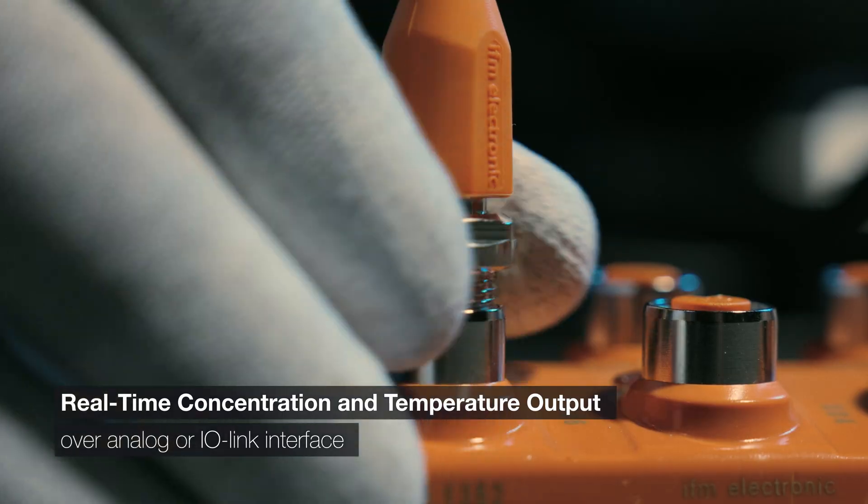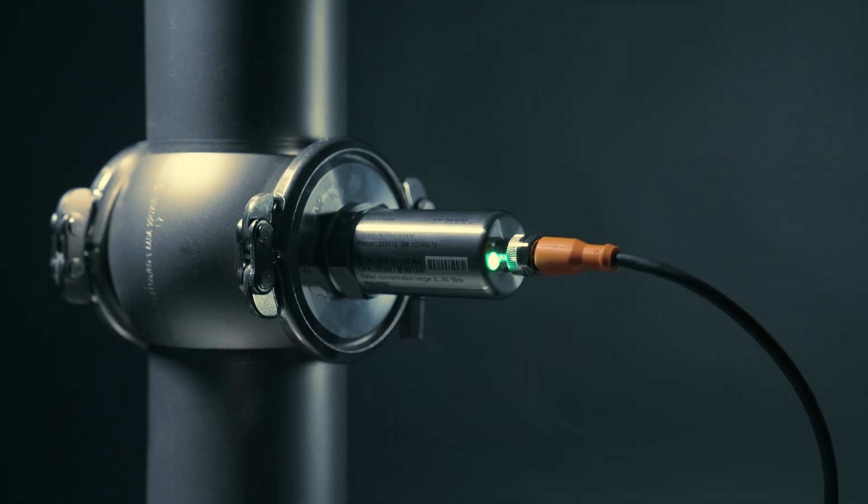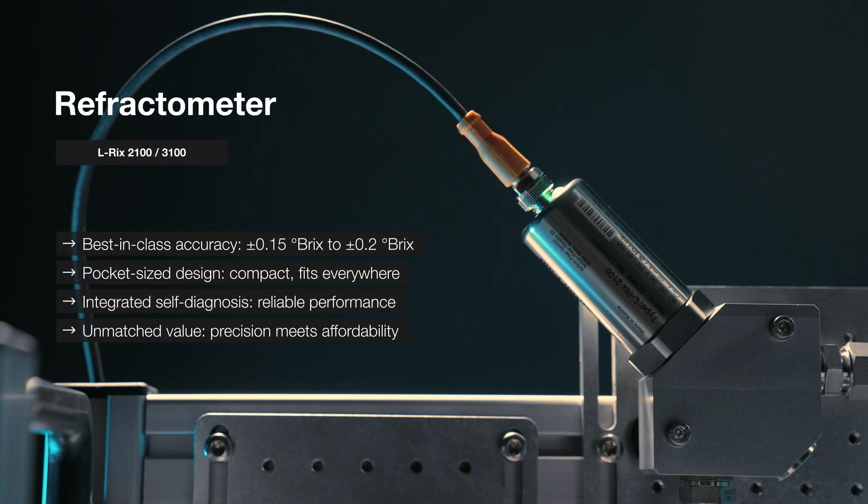Real-time concentration and temperature data delivered instantly via IO-Link. ELRICS 2100 and 3100 — pocket-size precision, perfected performance.